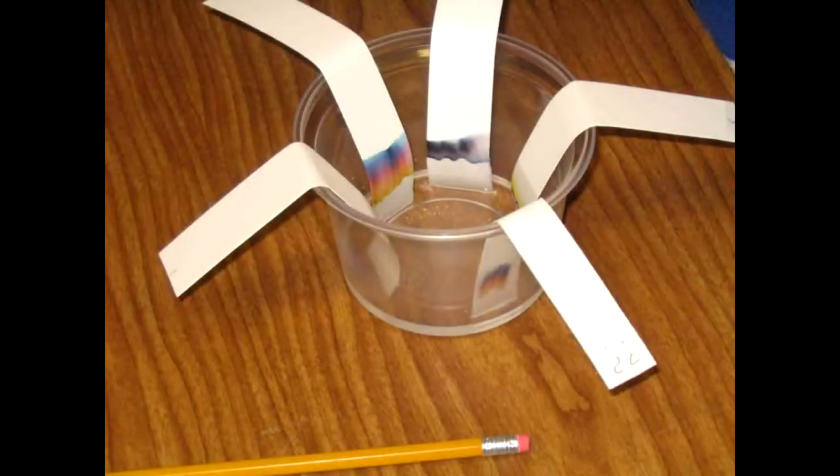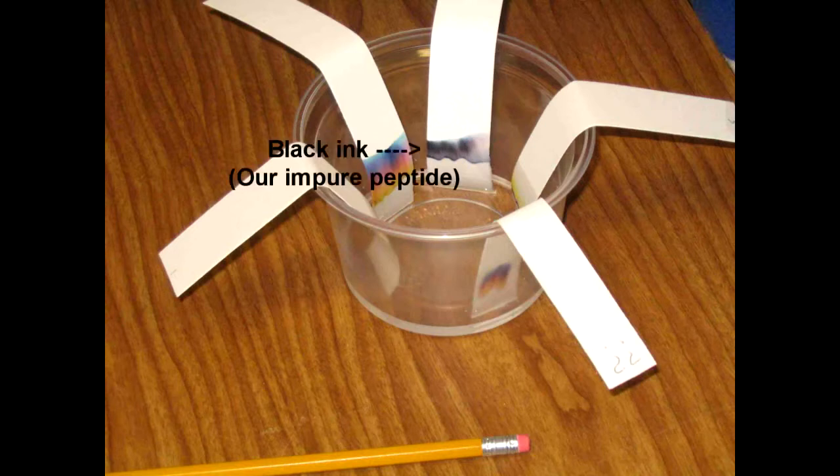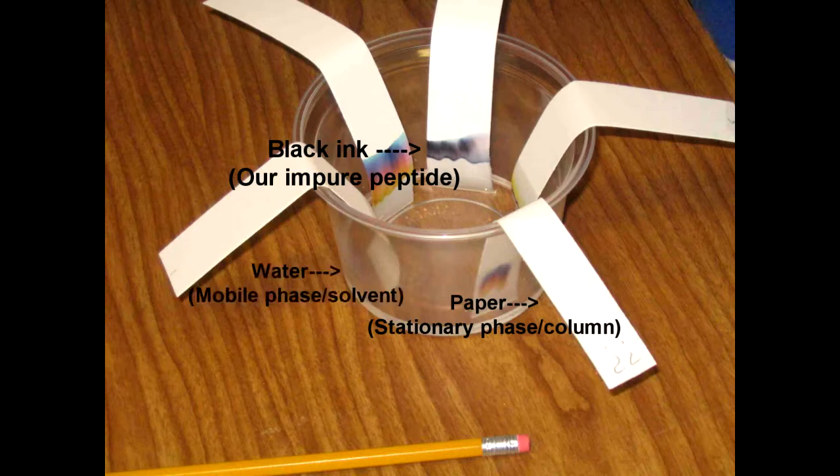A familiar demonstration of the concept of chromatography is the separation of ink using paper and water. In comparison with HPLC, we can see some similarities between these two experiments. The black ink in this case would be our sample, and the paper is the stationary phase, or our column, and the water is the mobile phase, which will assist in moving the sample through the column. On the HPLC, we must include a UV detector so we can discern the different components of our sample. This is similar to our eyes being able to see the different parts of the ink once it is separated.